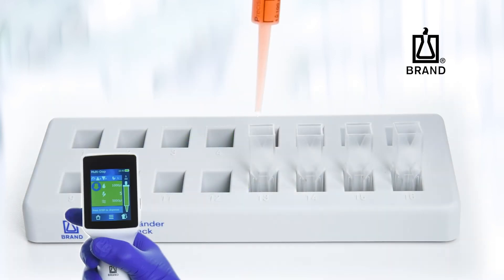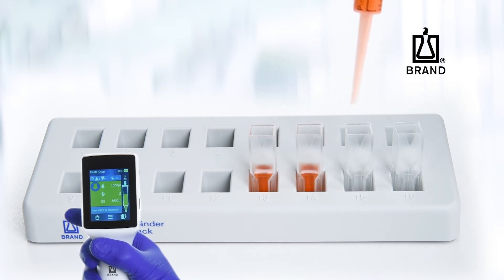Press the step key to dispense. The operating screen gives real-time feedback of the instrument's status.